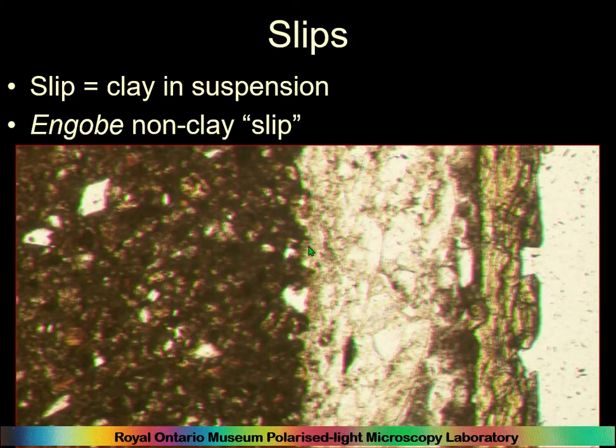Sometimes people use the term engobe, which is French for slip. It's like gobbed onto the outside, onto it rather. But this actually works quite well sometimes when the covering is not clay. And this is actually a stone paste slip, one might say.